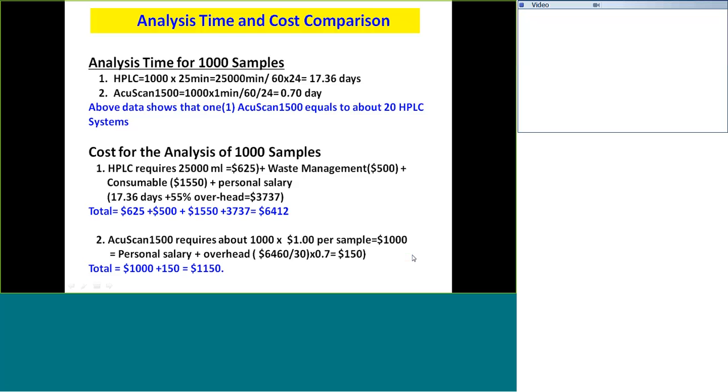In the laboratory, usually we just use the 96-well plate. It will cost about $2 US, and you can use that for 96 samples. It's not the cost that's the problem. My question is pointed to the regulations. FDA. Is there any regulation approving Raman? Is the result by HPLC the same as the result by Raman? You understand me?